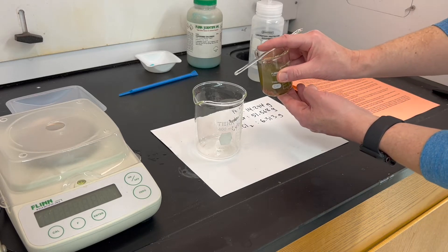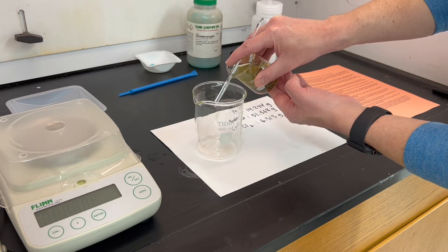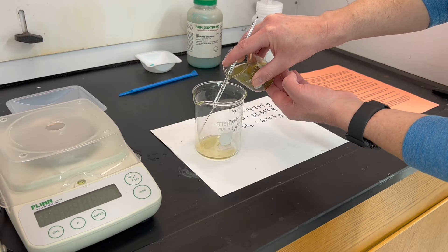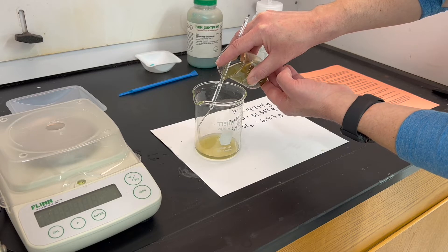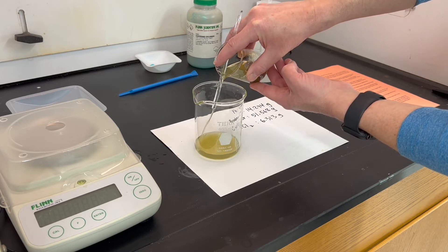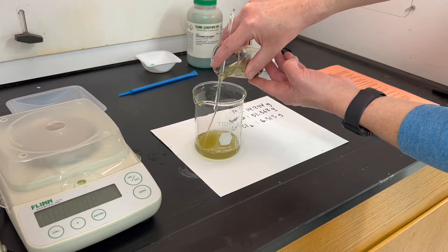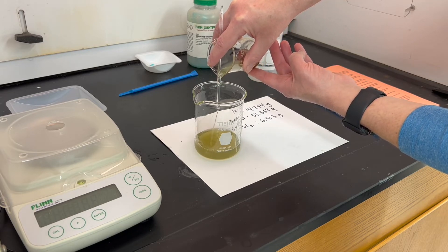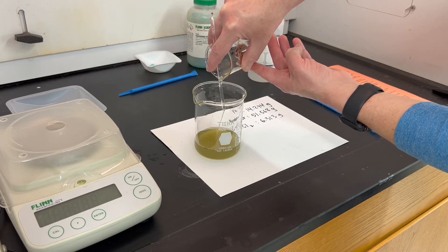Hold the stirring rod like that and pour slowly — it can also help direct the liquid. You will likely lose some fine copper particles at this step, so pour a good amount off in that first decant but not so rapidly that you lose a lot of the copper that formed.